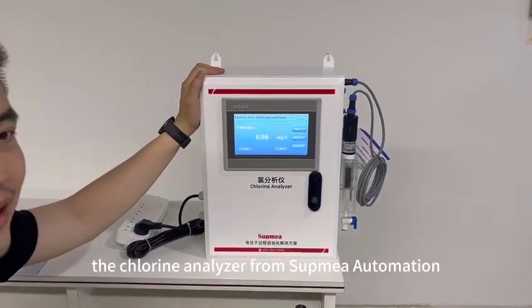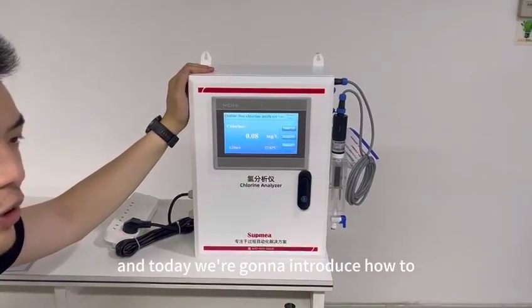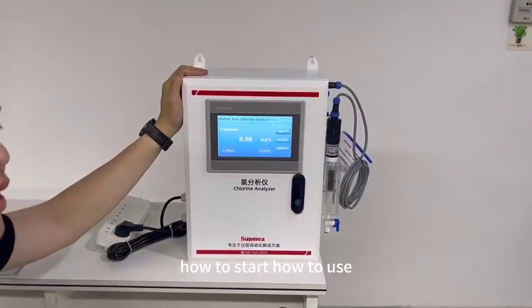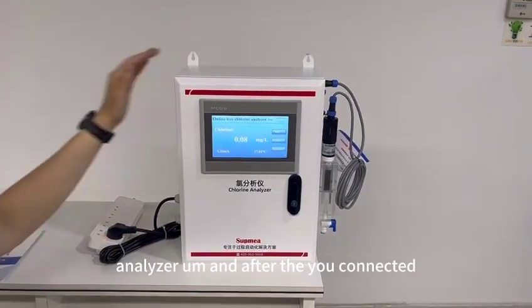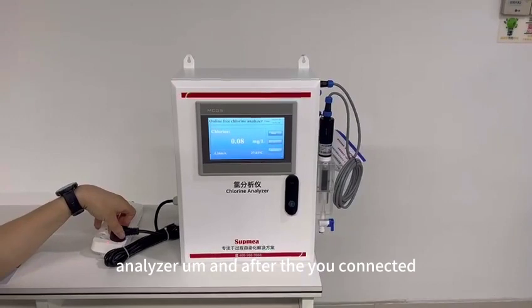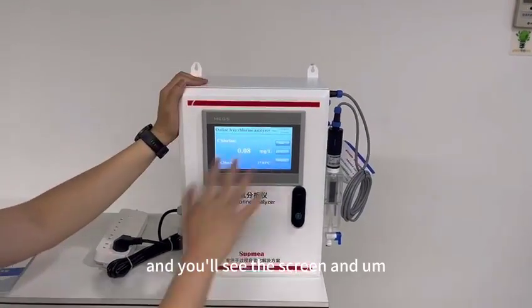Hi everyone, this is the Chlorine Analyzer from Supmea Automation. Today we're going to introduce how to start the analyzer. After you connect the device with the power, you will see the screen.